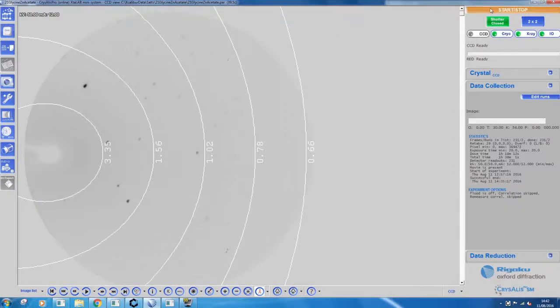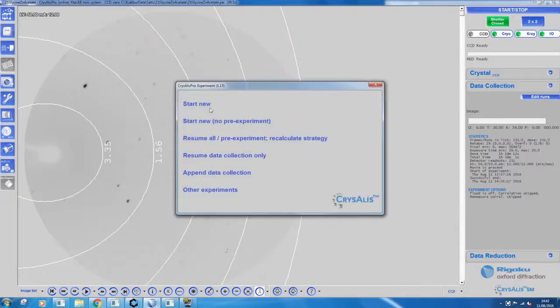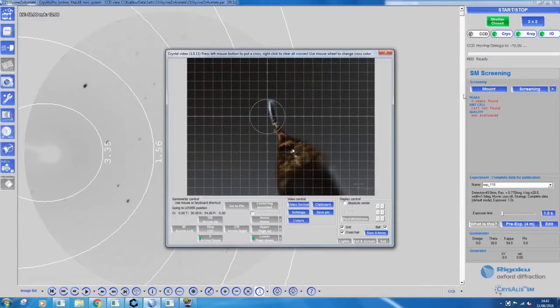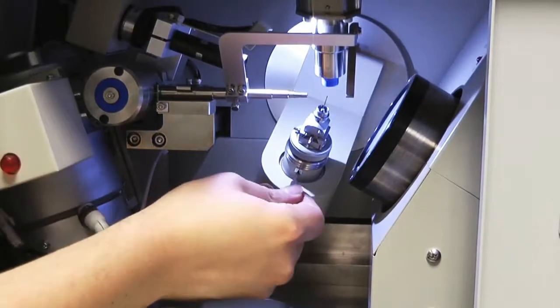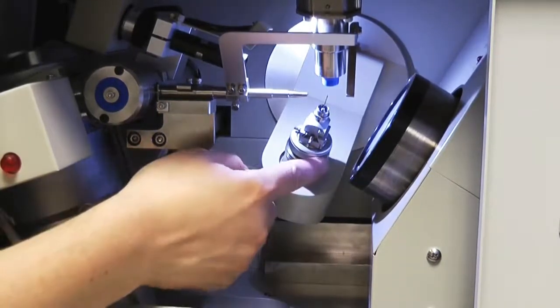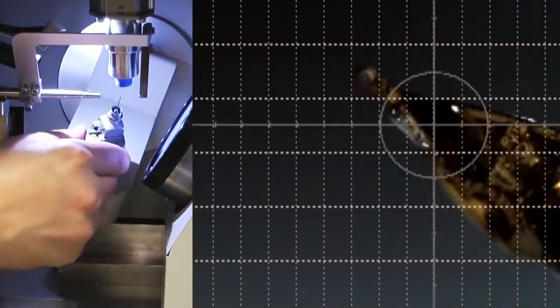Centering the crystal in the path of the X-ray beam is made possible through CrysAlis Pro. Press the mount button in software and a video image of the crystal will appear. First, unlock the phi axis of rotation. Rotate through 90 degrees and use the key to adjust the crystal until it is centered, no matter the orientation.